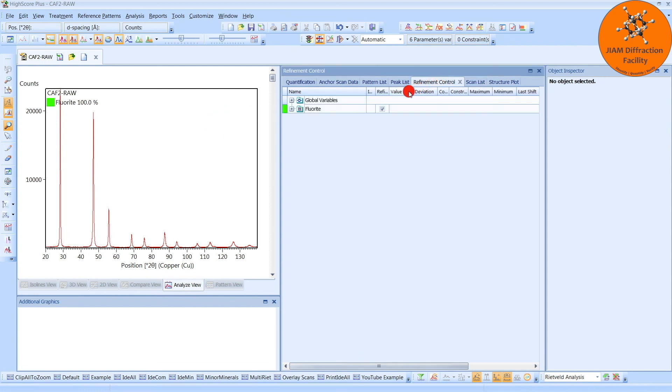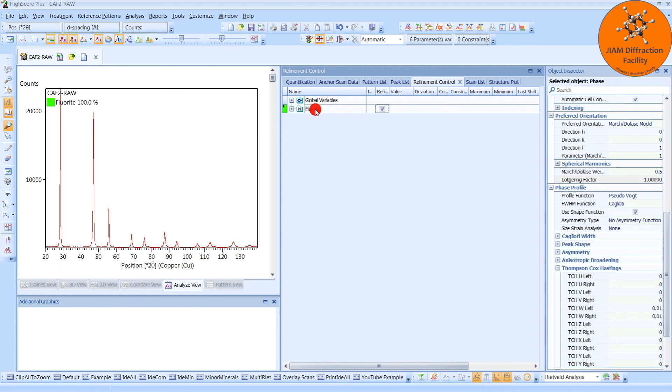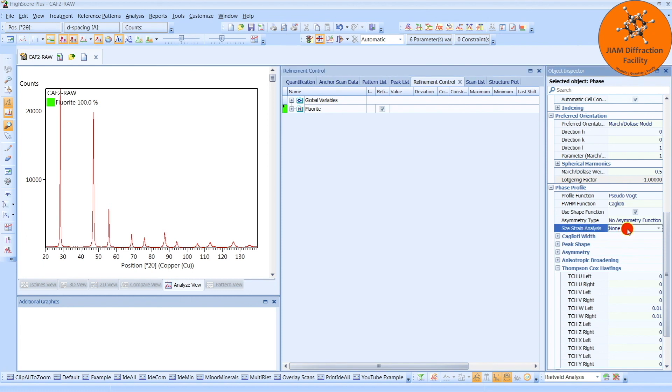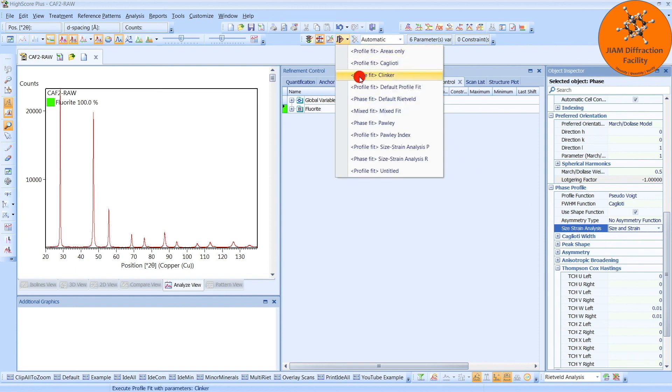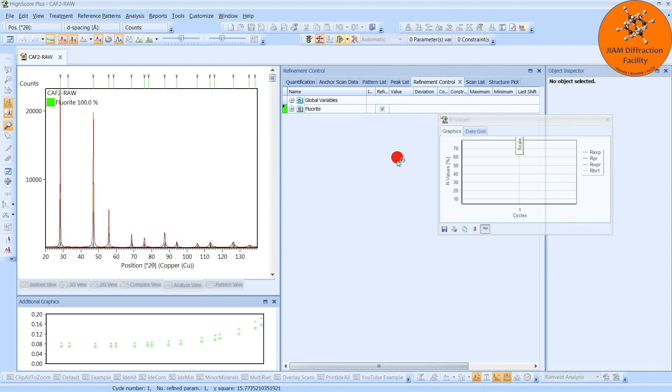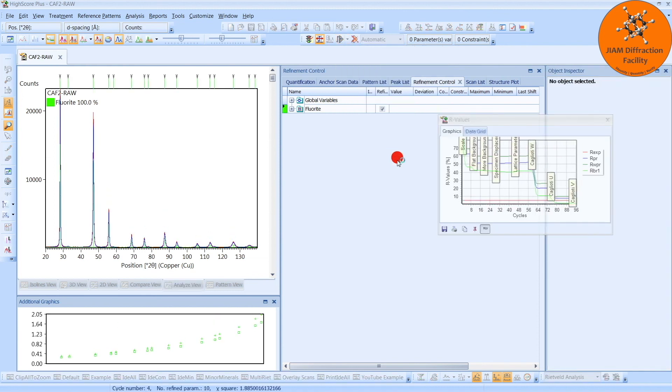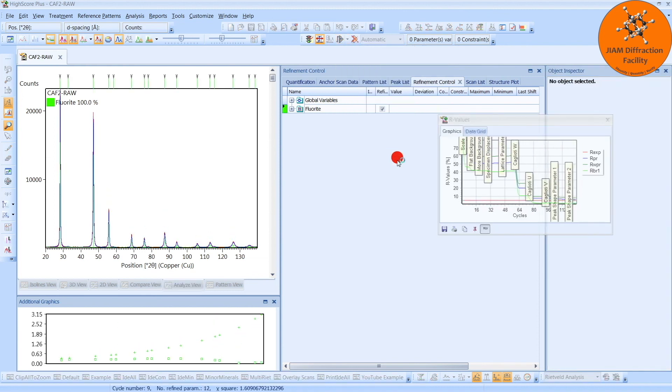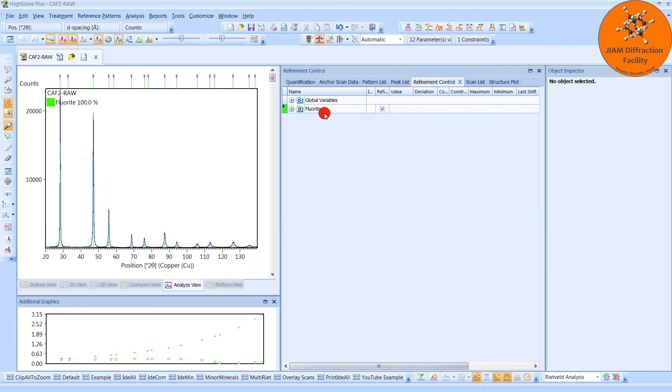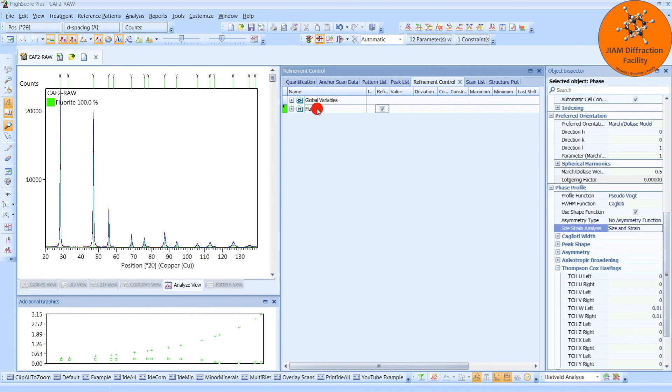and now before we perform a refinement, we just need to left-click on the phase, and then change our Size Strain Analysis to Size and Strain. Now we can perform another Size Strain Analysis R.